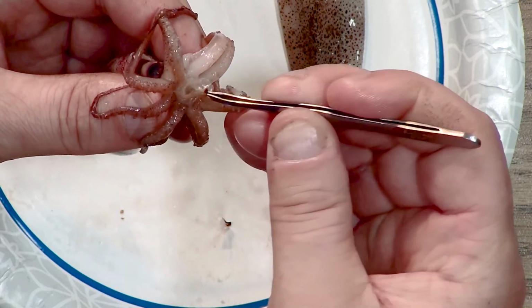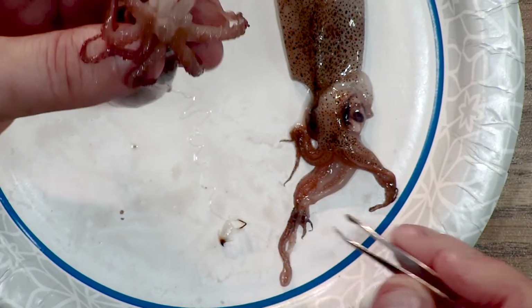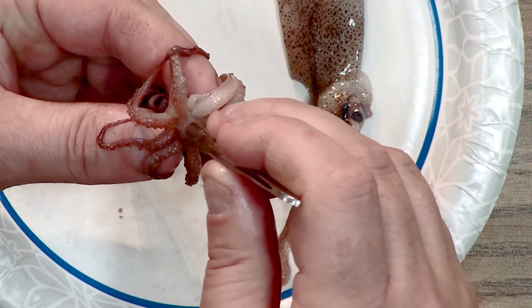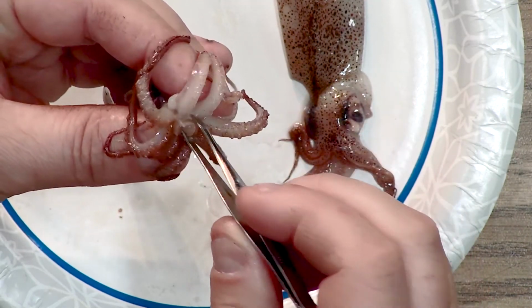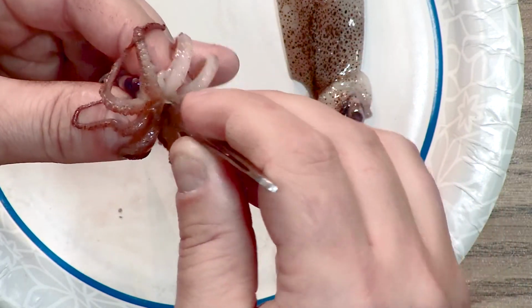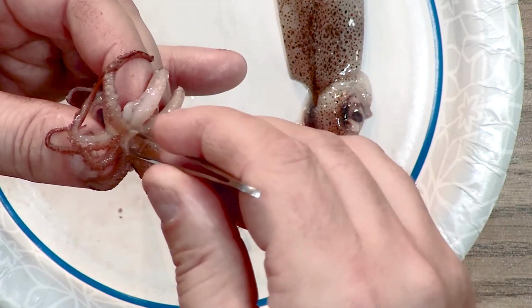I'm going to do the same thing. Oh, easy does it. And I've got both pieces now. Both pieces of that beak are out of the way, and that allows me to really open up the mouth here. So using my tweezers, I can kind of dig or cut in a little bit. And this is why the metal ones work really well.